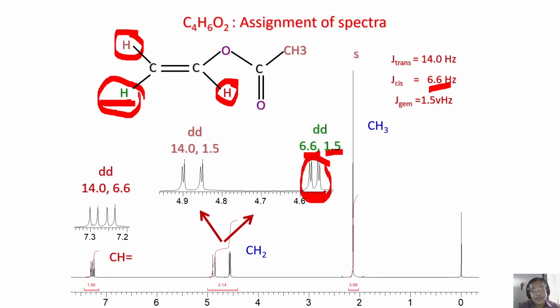So what I showed you is a simple molecule, utilizing the idea that trans coupling is larger than cis coupling, which is larger than geminal coupling. Looking at the pattern of the spectrum, all the three protons are inequivalent, and I could make the assignments very easily. This is why I was telling you, when I was discussing couplings, that trans coupling is always larger than cis. You remember, many number of times I told you varieties of examples. This is the reason. Those ideas will come into practice when you want to analyze such spectra. You can use those ideas.